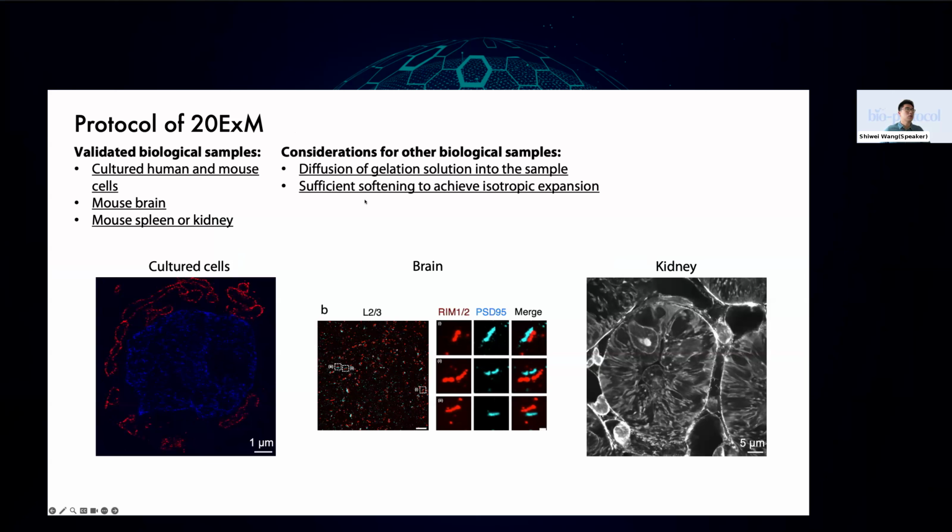And I saw that a lot of questions were posted about expanding into different cell types and tissues. And when we develop this technology, our hope is that as long as that tissue or cell type has been expanded before with different expansion protocols, this gel is feasible to replace the low expansion factor gel with this gel to achieve higher expansion factors.